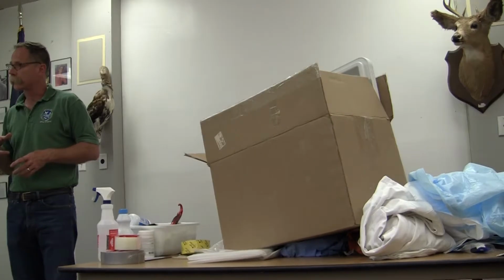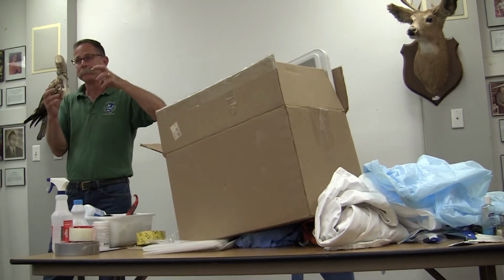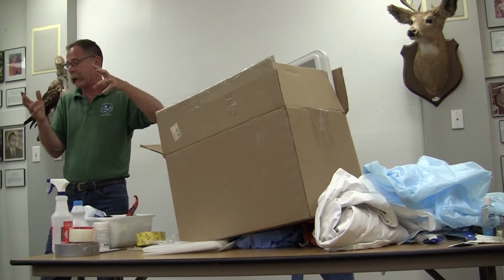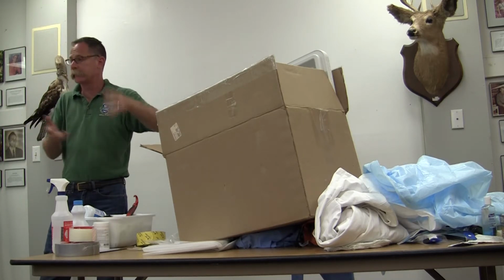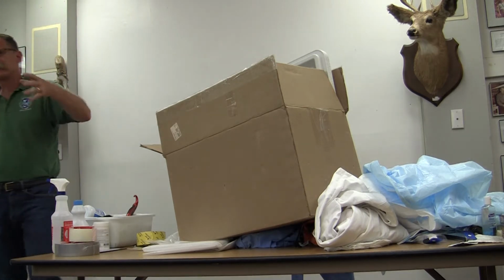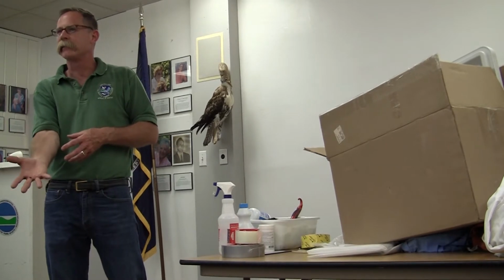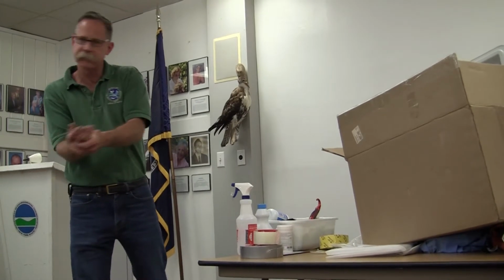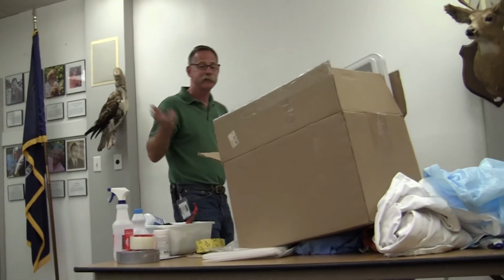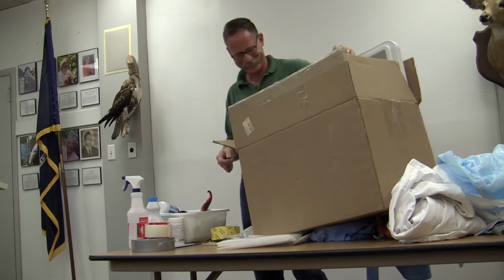Those maggots are going to keep working, even in the cooler. They kind of create their own microclimate. We've had instances in the lab where deer came in with maggots on them and we couldn't get to them that day. The next day, it's just a mass of maggots, and I take my gloved hand and stick it down in there, and it's just hot. They make their own microclimate, and it's really cool because they're moving around. You can feel it through the gloves, like a little massage. I'm sorry that you guys don't get to experience that. But if you transfer to the wildlife health unit, John's probably excited.